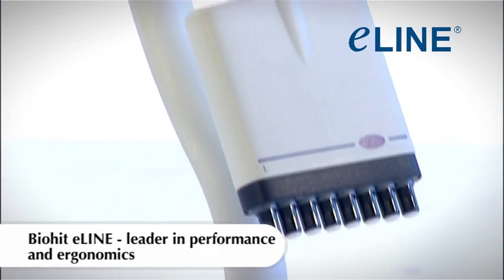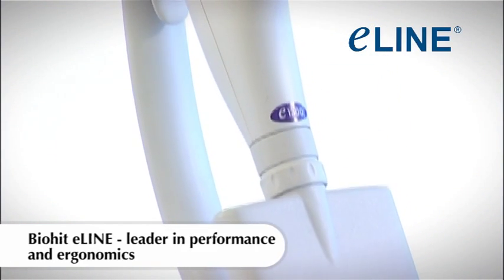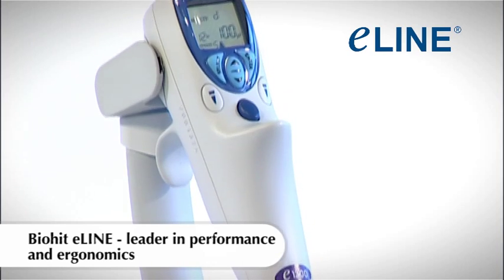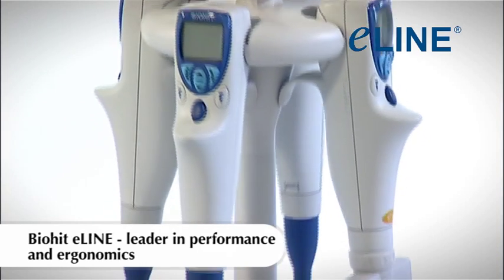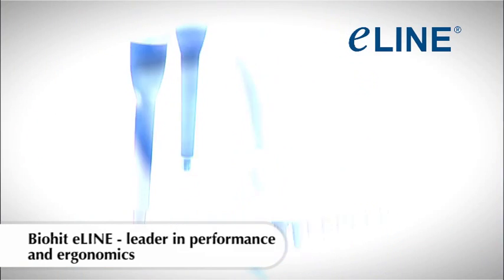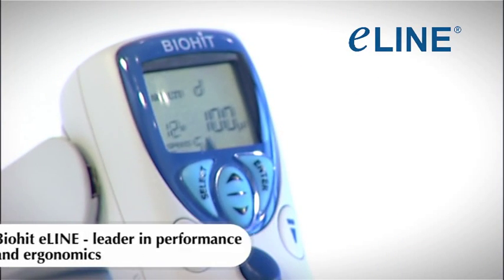The Electronic BioHit E-Line Pipette is the market leader in performance and ergonomics. This award-winning pipette takes the effort out of pipetting and significantly reduces the risk of repetitive strain injury.